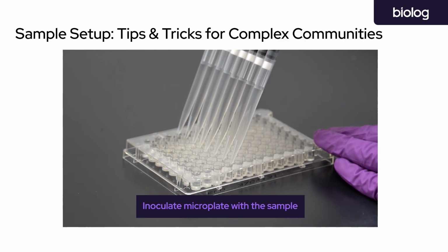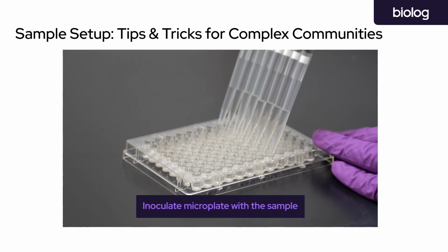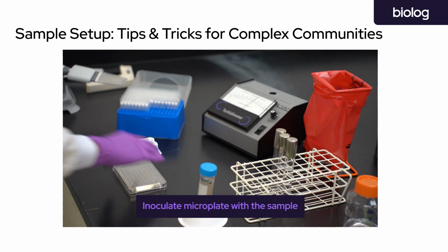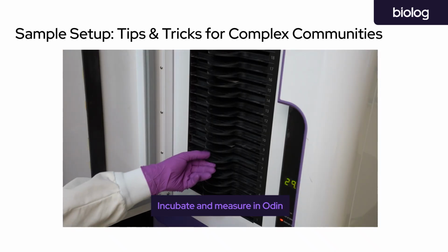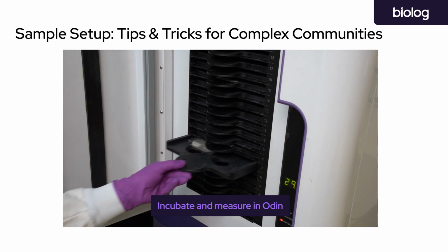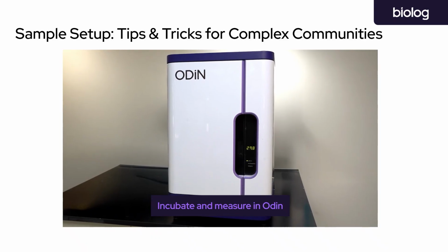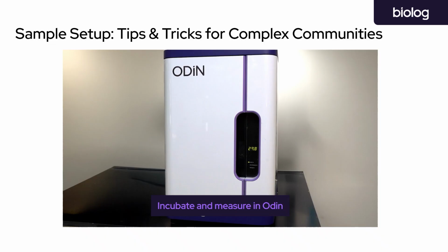Now when I do this, I try to avoid shaking the plate or mixing the contents of the plate so that I don't create any bubbles. And that is it. At this point, I put the lid back on and it's time to incubate and measure with the Odin. Now typically you want to do this for at least 48 hours, but you can do this up to 96 hours. And we'll wait for results.